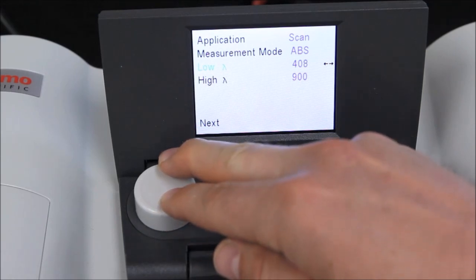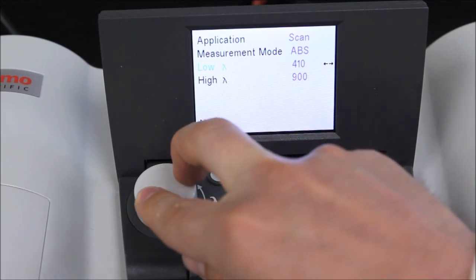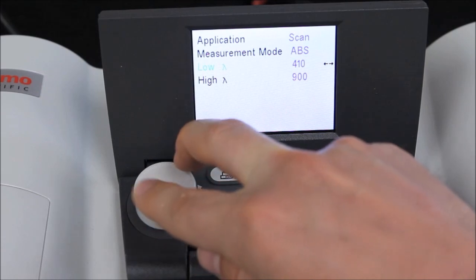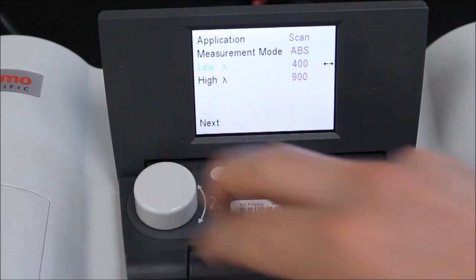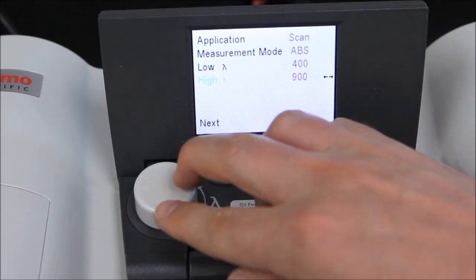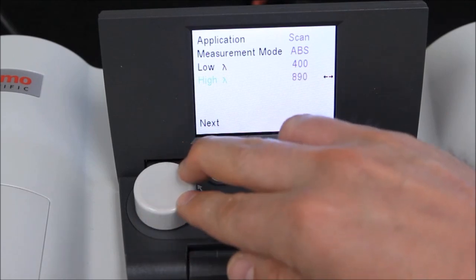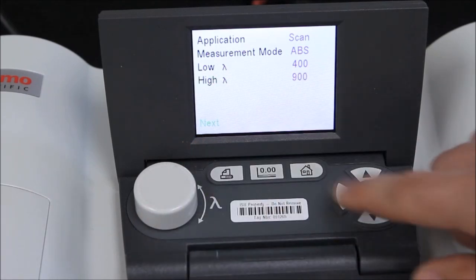By pushing down on the knob and turning it, we can increase or decrease the wavelength in 1 nanometer increments. When we are satisfied with the scan settings, navigate to Next and press Enter.